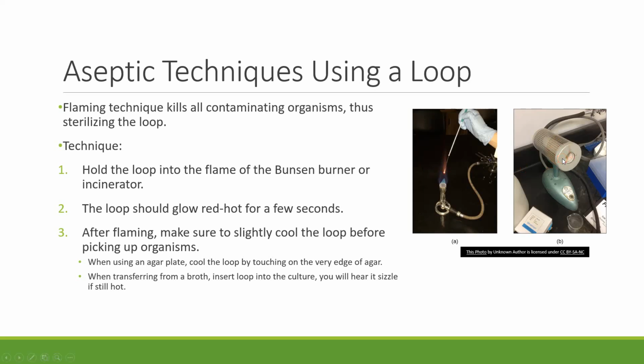Or we can stick it into the incinerator, which again, as I mentioned, was kind of like a kiln. It too will get it so hot that the loop will become red, and we're going to want to leave it in there for several seconds, again, to incinerate any contaminants.